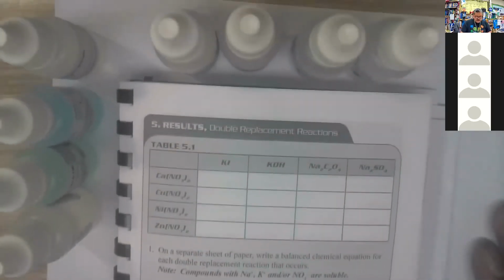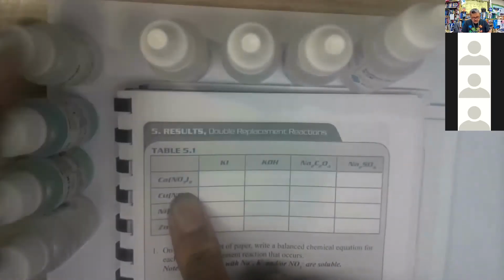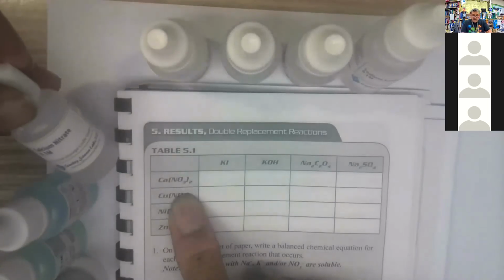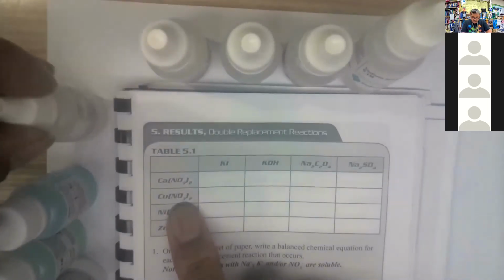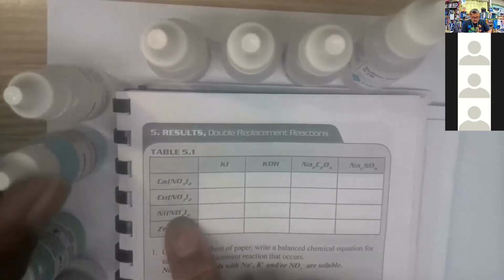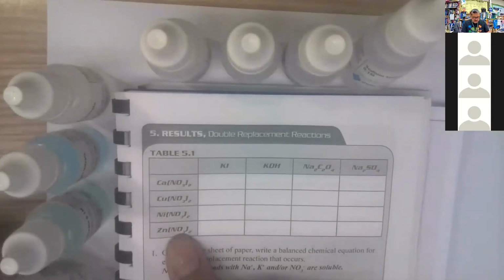But right here, here's the potassium iodide, the potassium hydroxide, the sodium oxalate, the sodium sulfate. And then going across this way, we have the calcium nitrate, we have the copper nitrate, we have the nickel nitrate, and then we have the zinc nitrate.